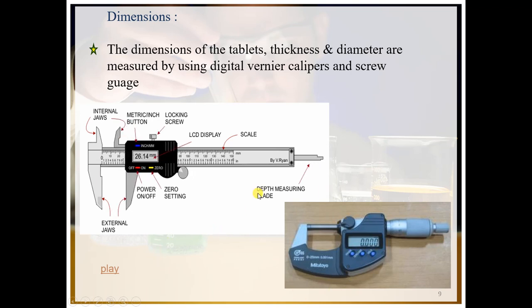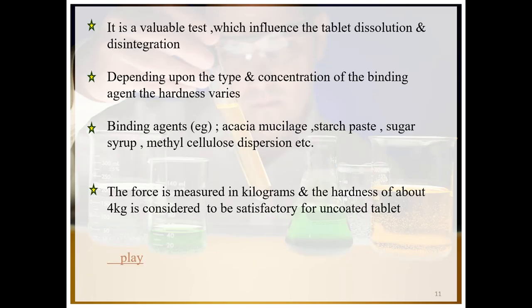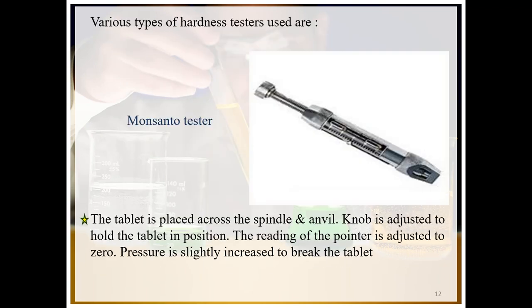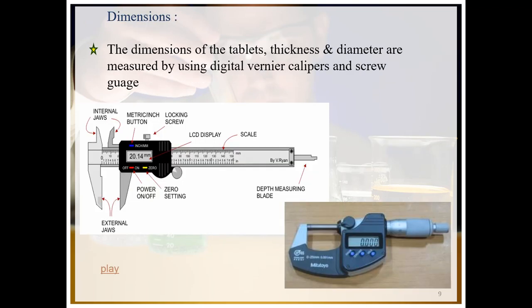Or you can see we can check the hardness of the tablet. Inshallah, in my next lecture we shall talk about hardness, which is the unofficial or physical test usually performed for solid dosage forms, that is tablets.